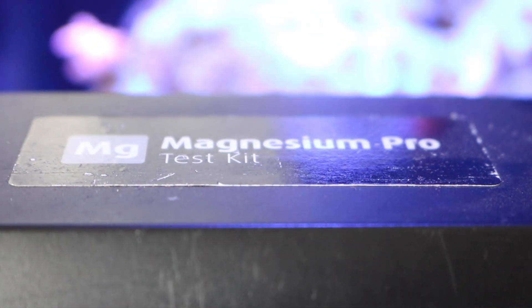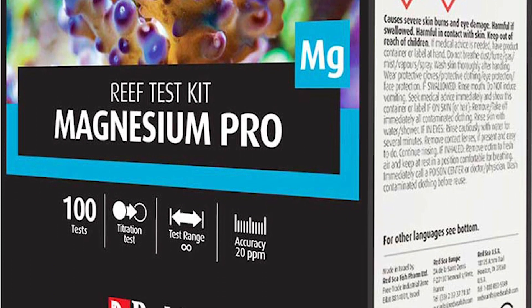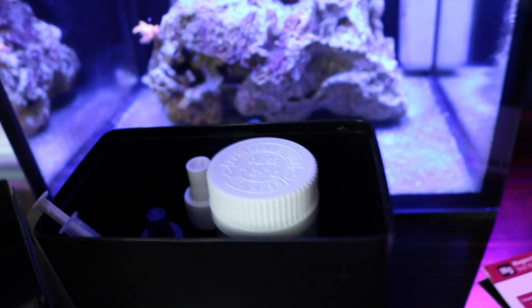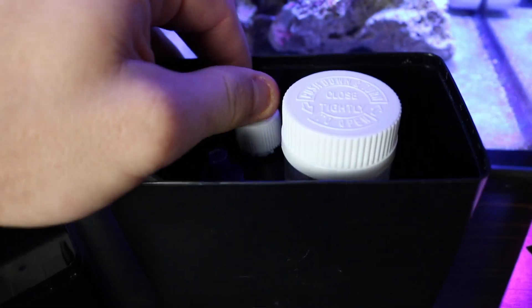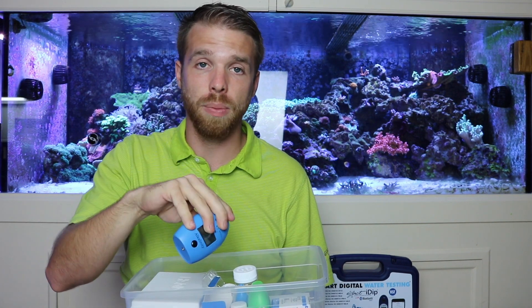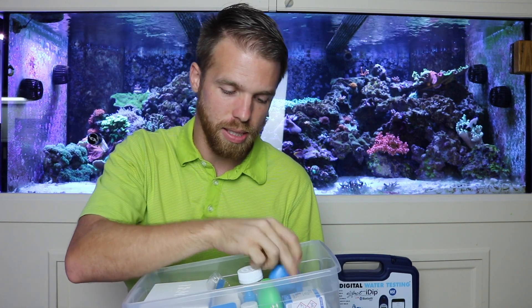I use magnesium every now and then to check levels — it's pretty easy with the Red Sea titration magnesium test kit. I definitely love the Hanna checker for alkalinity. It's great, it's easy. You just take a sample of water, zero it, put the reagent in, click the button, and you get your reading super fast. Love that.